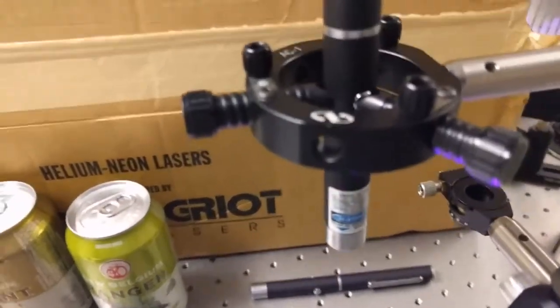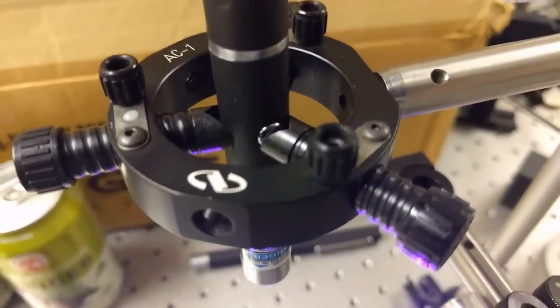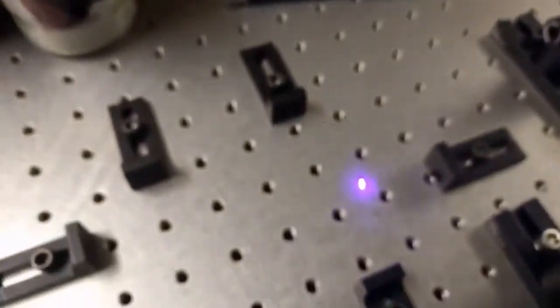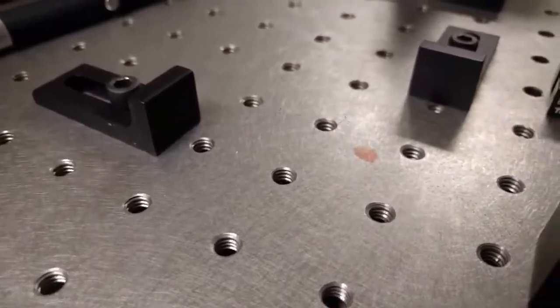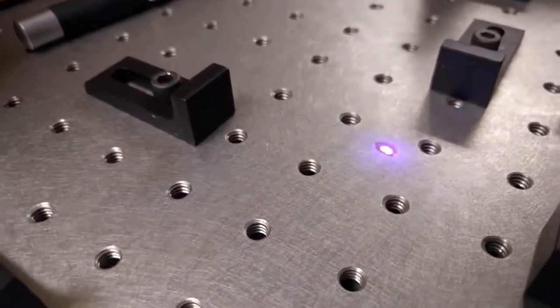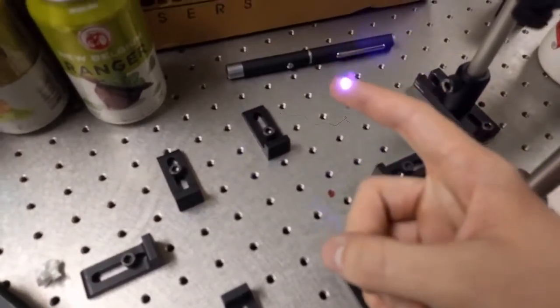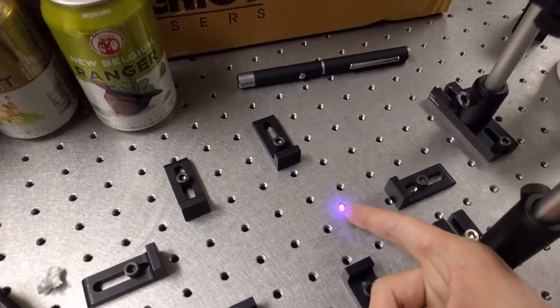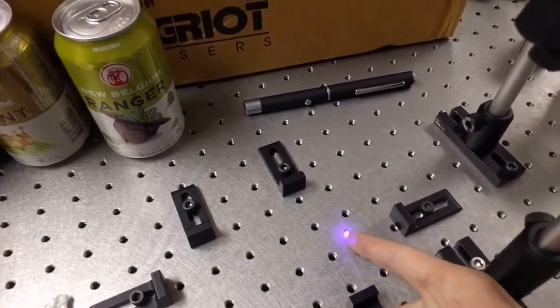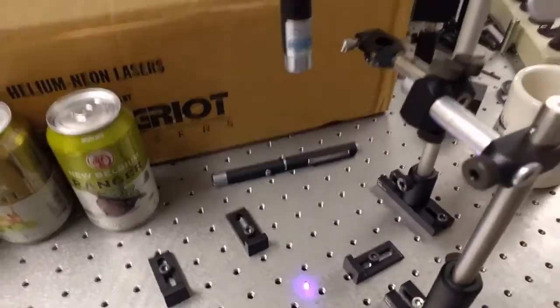The first thing to do when calibrating the instrument is to turn this dial so that it's pressing on the laser button, and you want it so that the laser is pointing on top of this red dot marked with the Sharpie. And the reason for this is because the laser is going to come down right on top of the camera, which is in my hand right now, and we can just use this Sharpie to mark where we already know the laser hits it.